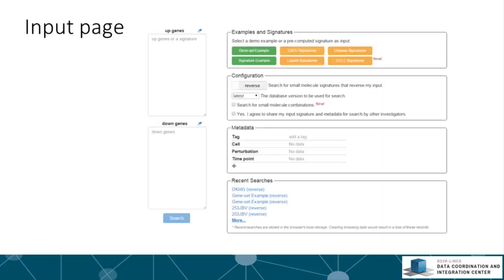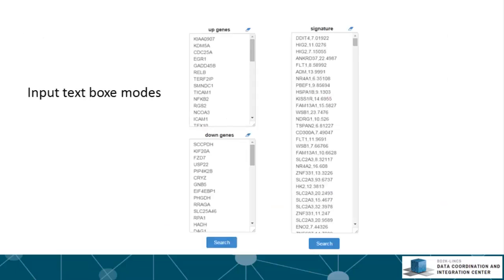Now let's go to the site and examine the various parts of the app. The input page consists of five sections: input text boxes, examples and signatures, configuration, metadata, and recent searches.